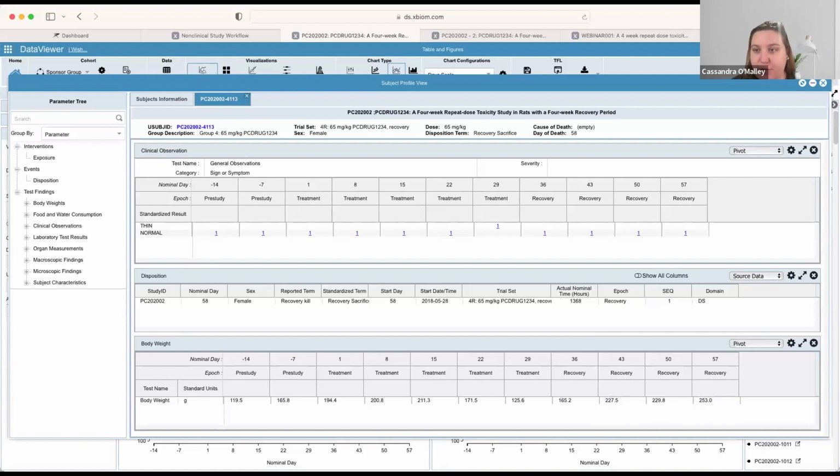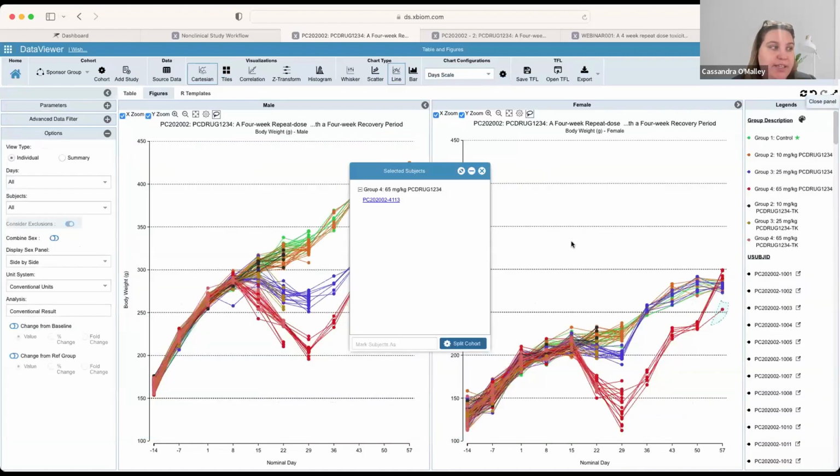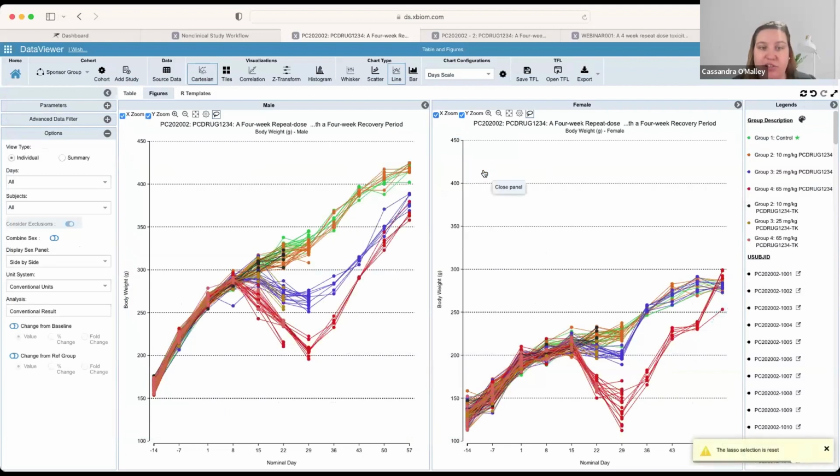If I had my study report open and I double checked these values, I'm going to assume that this is correct, but I've now added an additional QC check to my SEND dataset, and I ensure that the value matches what was collected. Similarly, I can use some auto-generated tables, and I can compare them to the report, and we will get to those in a moment.